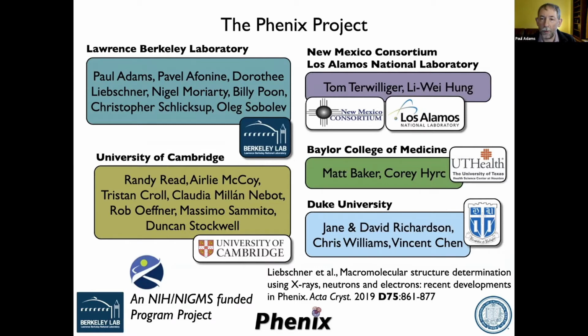Just to add a little bit to Yakomba's situation here, this is a slightly special case in that these 7 angstrom particles are actually from the same set of cryo-EM images as much higher resolution reconstructions of a larger complex containing the same proteins. This is just a smaller fragment of the larger complex that is able to be reconstructed separately. And so it probably does actually have the same ligands in it, but as you say, you can't actually see them.